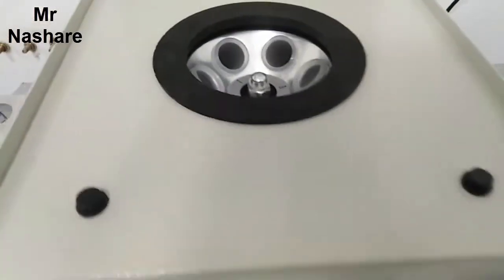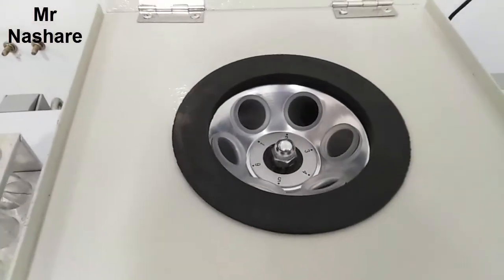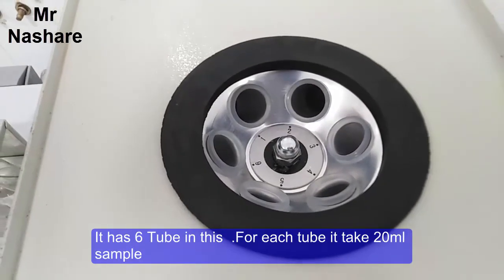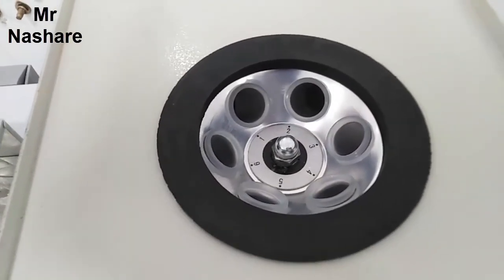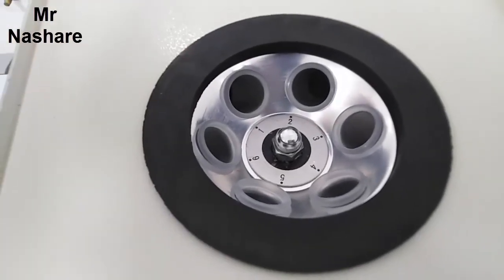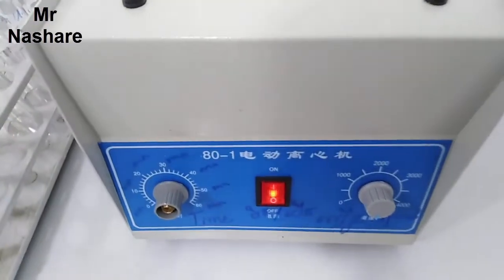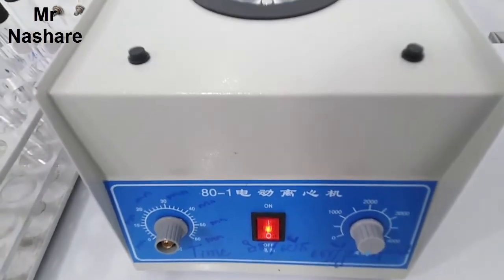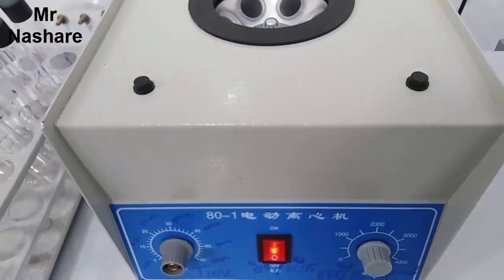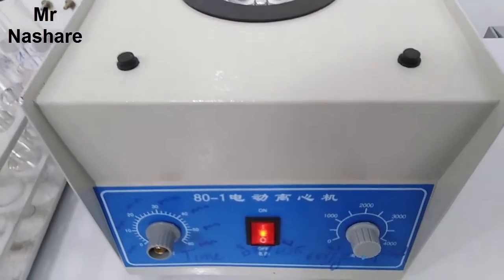At the input of the machine we have 6 tubes. For each tube we take 20 ml of sample to experiment, and then we start to practice on this machine by taking the sample from outside.